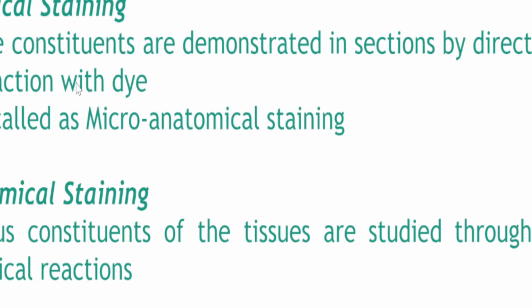You want to know if the sample has HER2 cells. What's HER2? HER2 is a marker for breast cancers. There are two types. I don't want to go deep into that because that is histopathology, more for the pathology residency exams. That's not the type of exam you're going to take. What you will take is the principles of those stainings, what's happening in the staining, not the interpretation of the results, but more on how the result came into being.